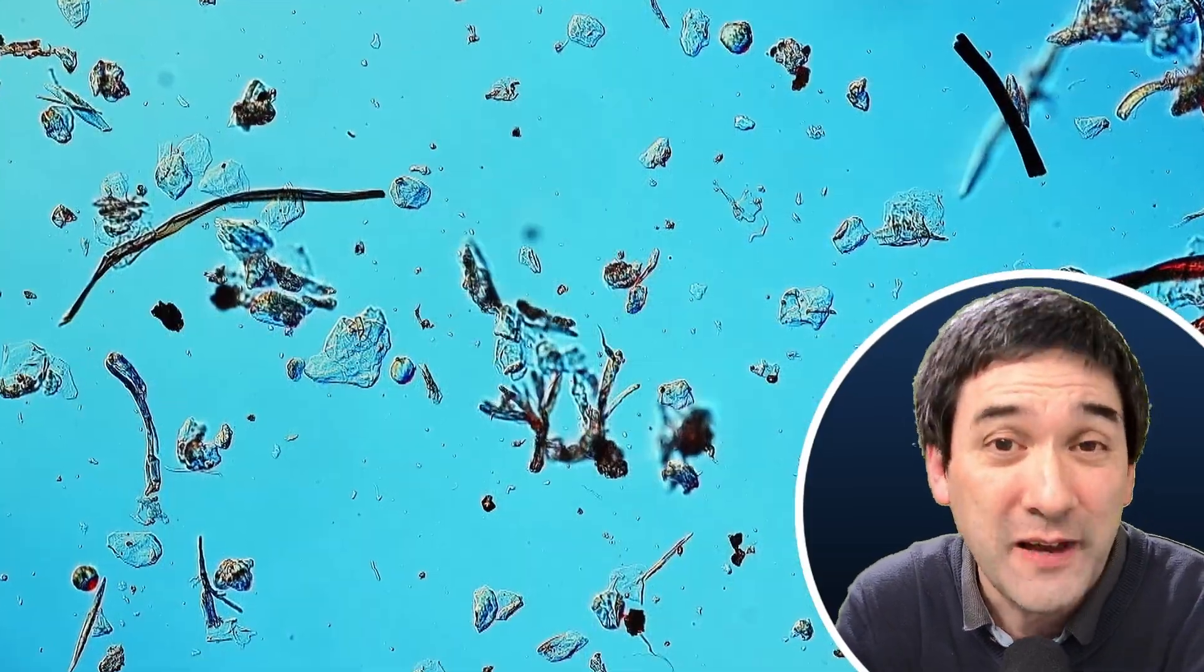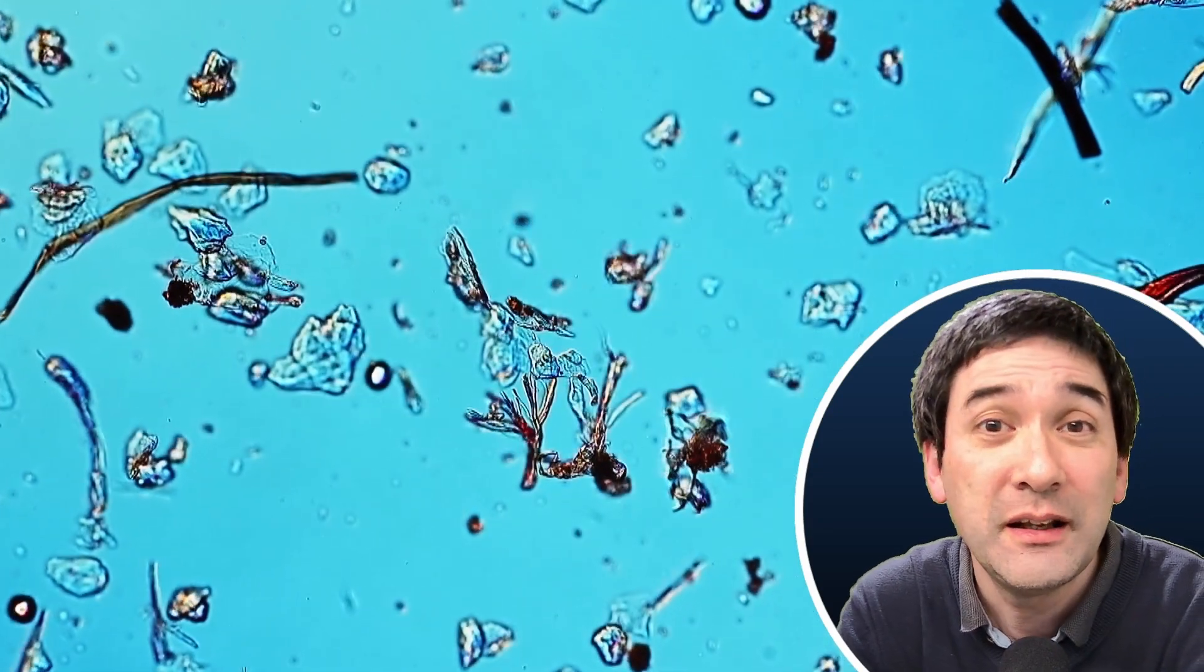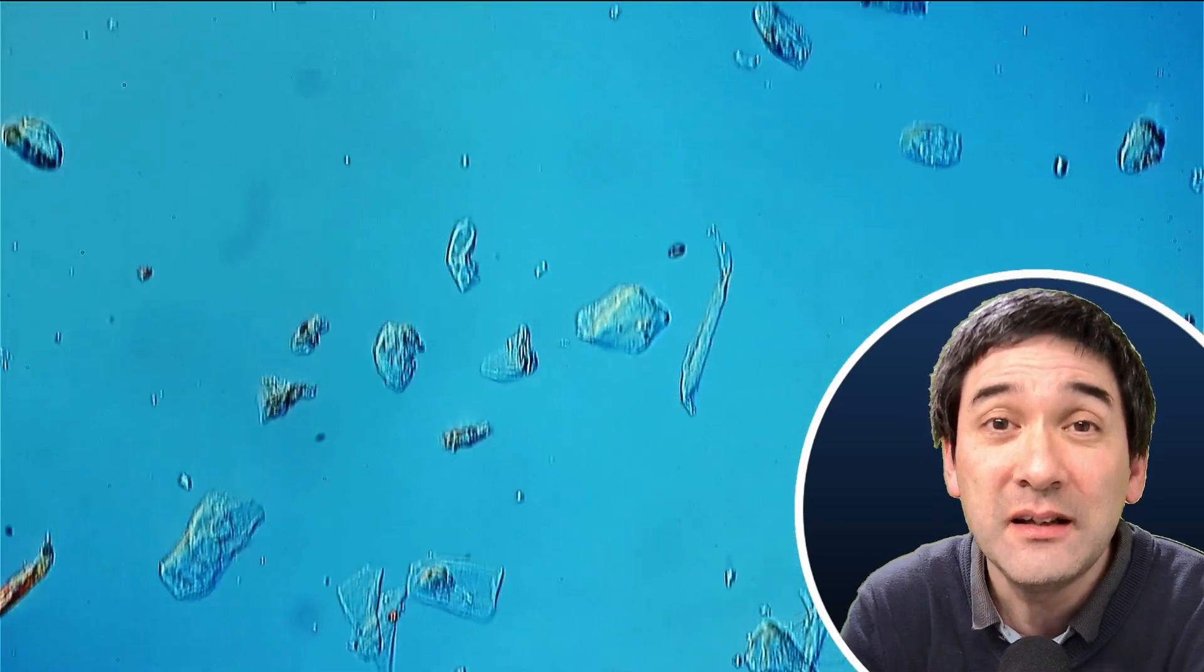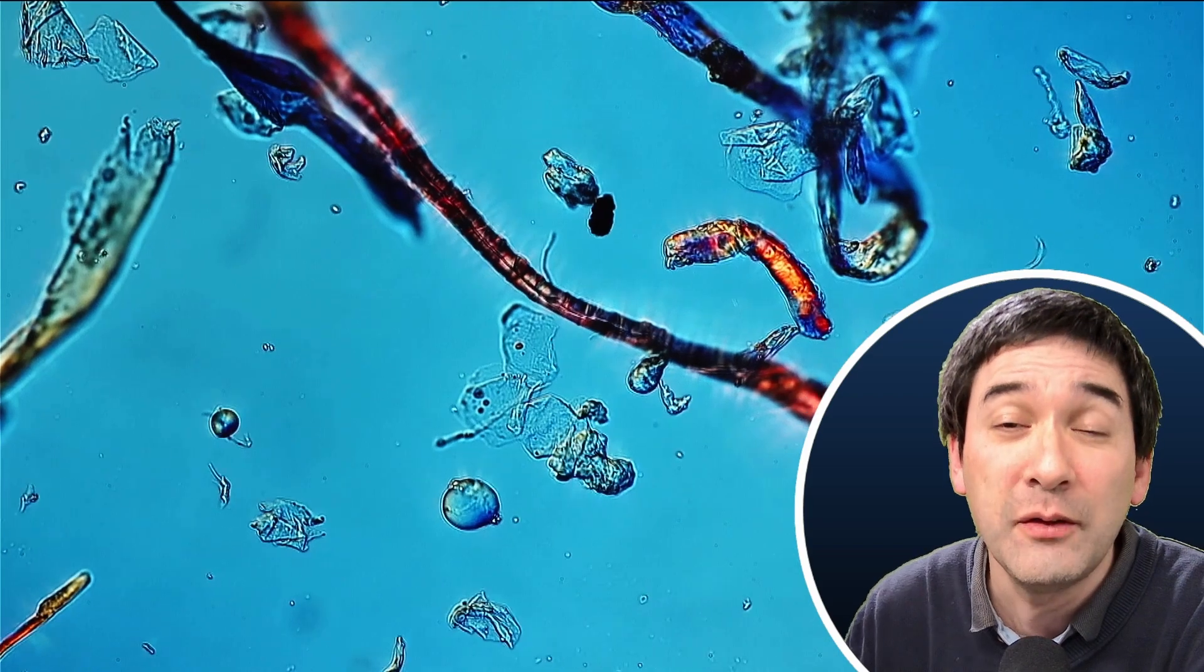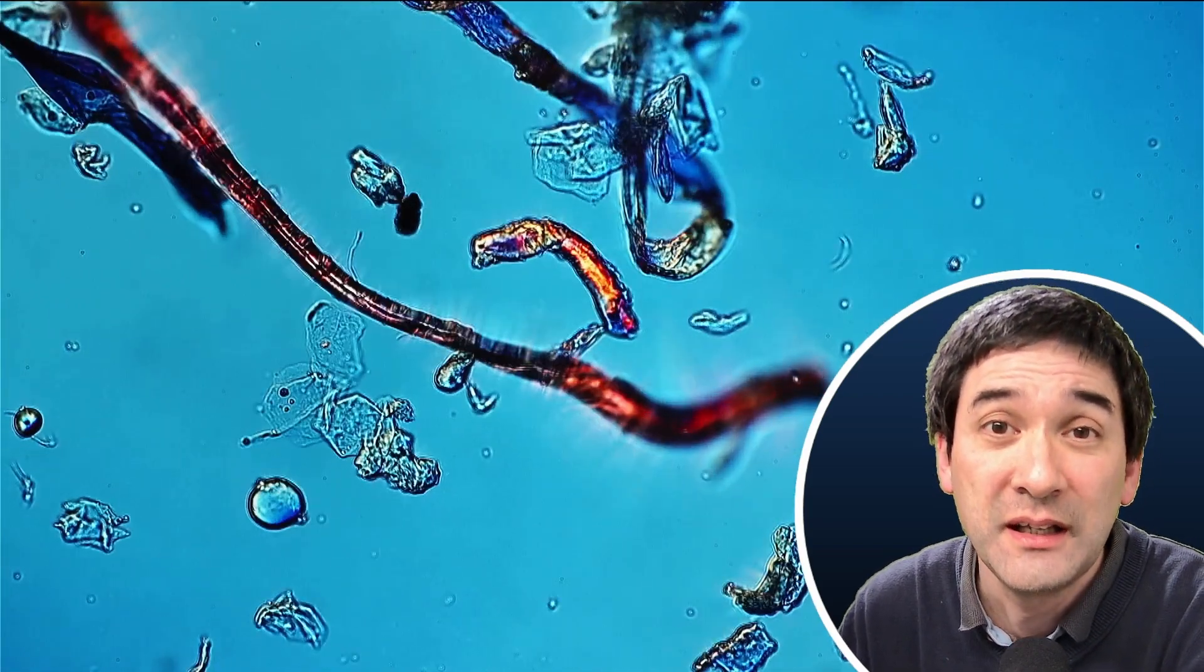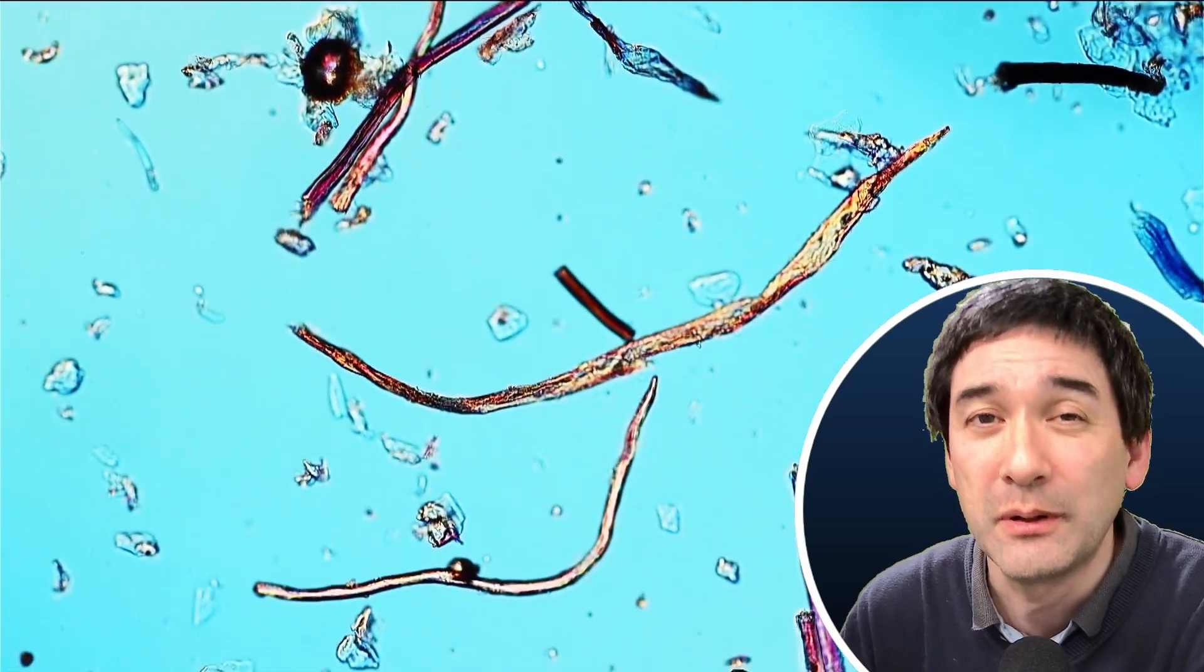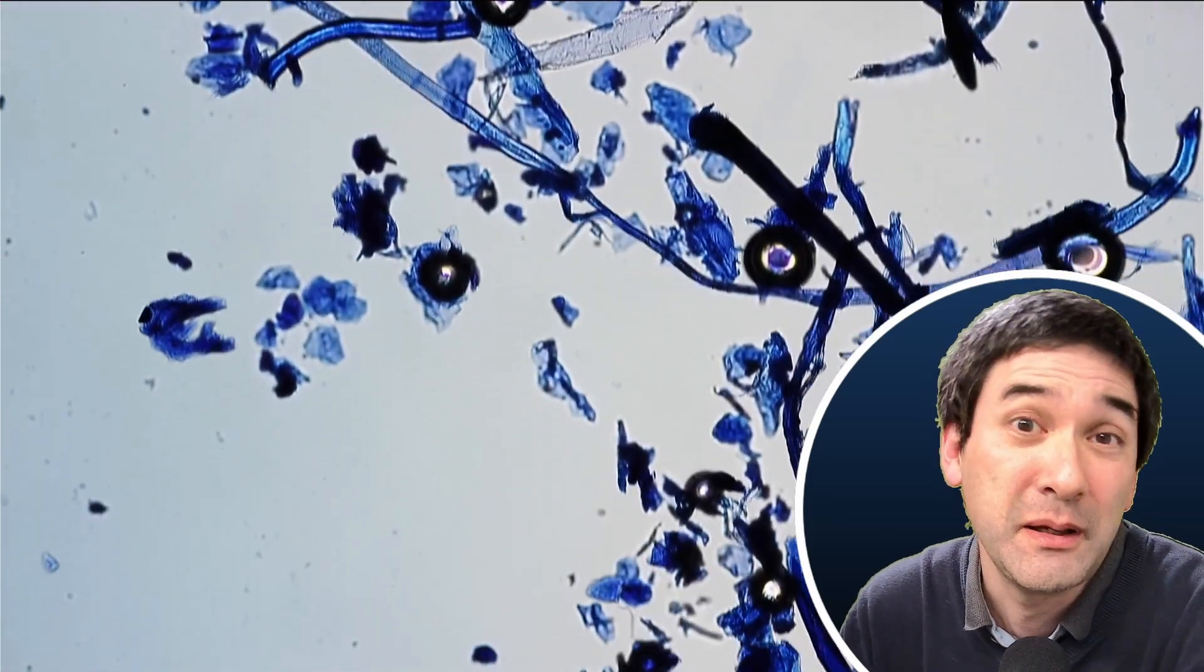But between those fibers, this is where I saw those irregular structures. And they, of course, are mostly skin cells. Now, skin will shed off from the surface of the body and they will actually comprise a significant part of the dust that can be found in a household. The question is, how can I make them a little bit more visible? Is there any way that I'm able to make them at a higher contrast?